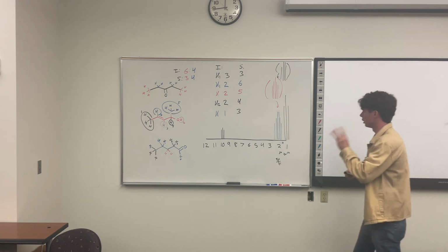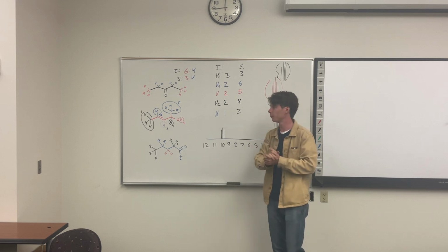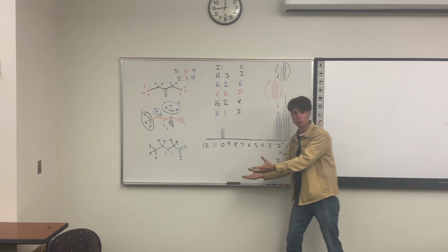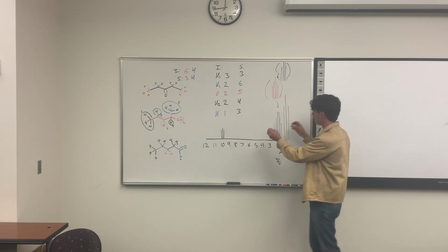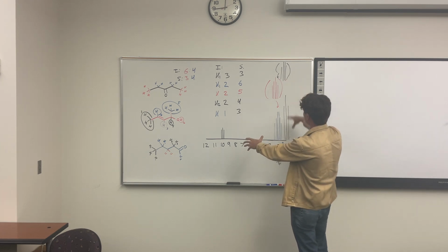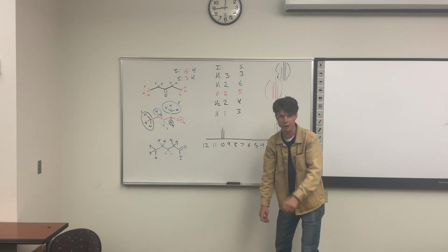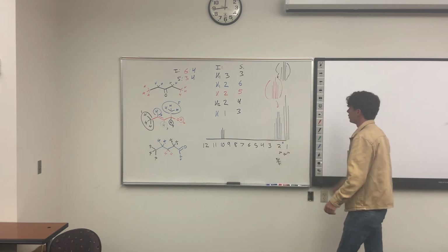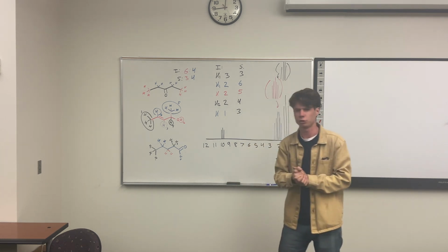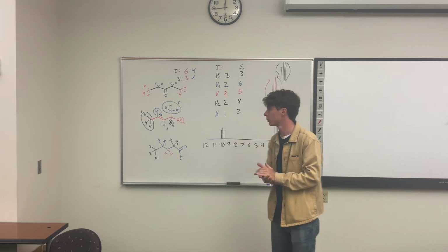And there we go. 3 different specs, all for the same chemical formula, but by rearranging where the bonds are, I can make different functional groups, and we use spec to really identify what we're working with. We can be provided only this and say, oh geez, I have a lot of alkane groups, and then oh, I have 1 functional group. I look at my chart, probably an aldehyde. And then you can use the splitting to help you out even further and predict the molecule, which you did in lab. If you didn't do that in lab, sorry, this is what you have only. That's disappointing.